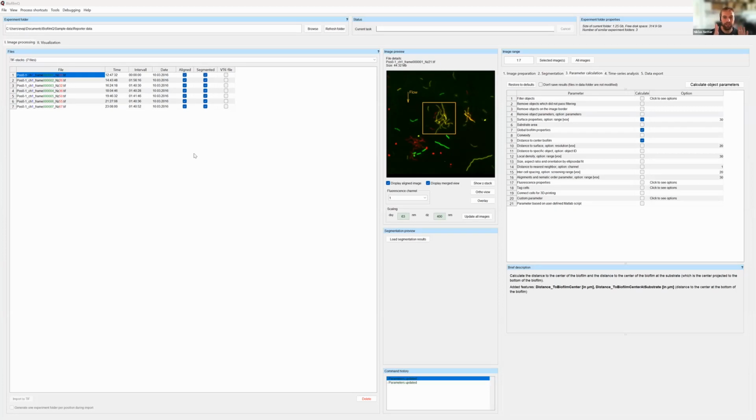It also might really depend on the different image intensities. If you have cells that are green, but some that are very green and some that are less green, and then there's the background green, then this might be problematic. But if you have a very unimodal distribution of the bright cells that you want to segment, I think it should work. But if you have a very wide distribution of the bright cells, then you have to play around with this.